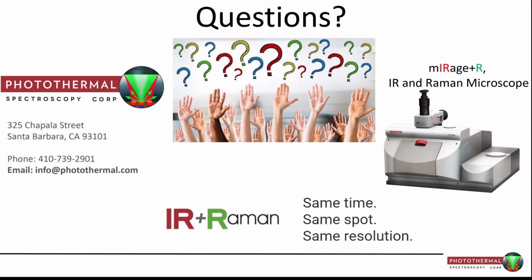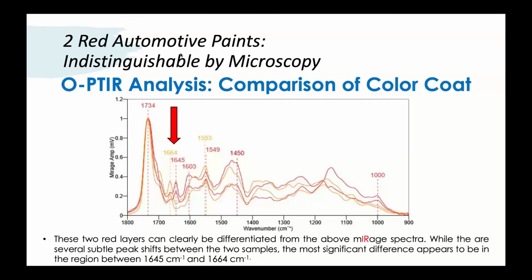This next one, Brooke, is certainly aimed at you. The question says, how could this data be incorporated into the PDQ, whatever that is? I'm sure you'll tell me in a minute. So the PDQ is the paint database query.